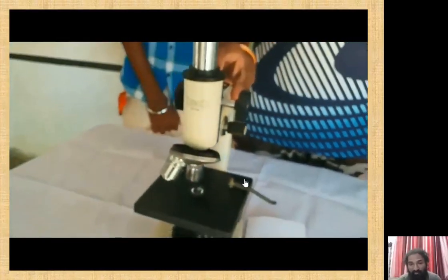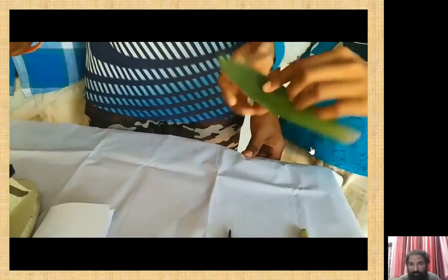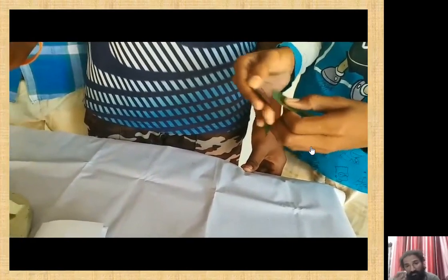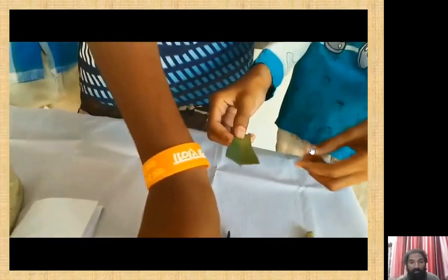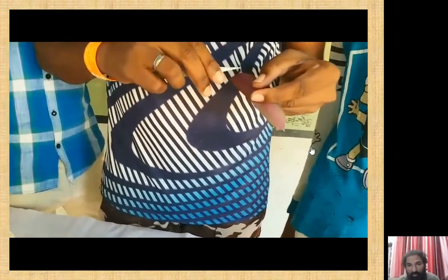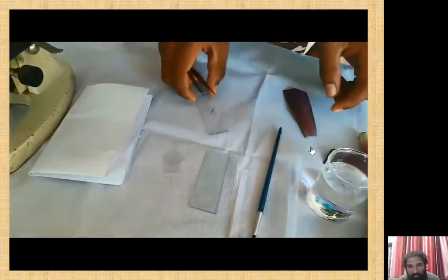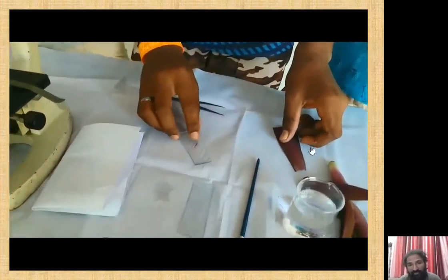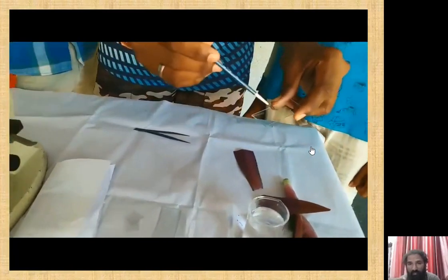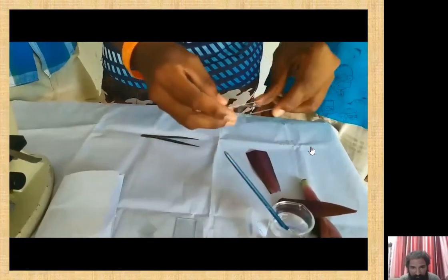First we take a Rhoeo leaf and fold it to the back side, where the violet color is present. We take the leaf from that side only, because the leaves show deep violet or pinkish color. Now separate that light colored portion with the help of forceps. After the separation, the leaf portion is placed onto the glass slide. With the help of a brush, add one or two drops of water on the surface of that light colored portion.